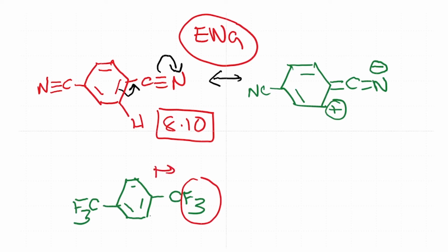And the chemical shift value of this hydrogen here is 7.78. Okay, so let me just rewrite that. The value is 7.78. Okay, so this value again is much greater when compared to benzene. So the CF3 definitely has a significant effect.